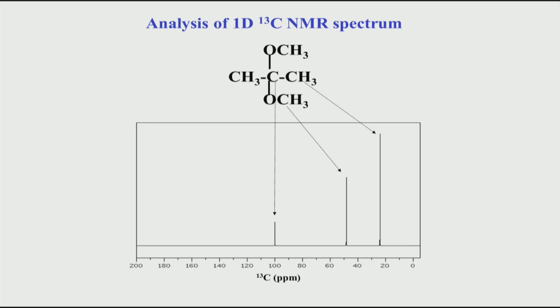So, this is something we saw earlier, that you need 3 to 5 times the relaxation time T1 for the relaxation delay value. So, if you have a long relaxation time, you need a correspondingly longer relaxation delay. But it is not practically possible to do that, because this may run into several tens of seconds. So, we cannot afford to wait for 5 times 10 seconds, which is about a minute, whereas other carbons may have a short relaxation time, only a few seconds.